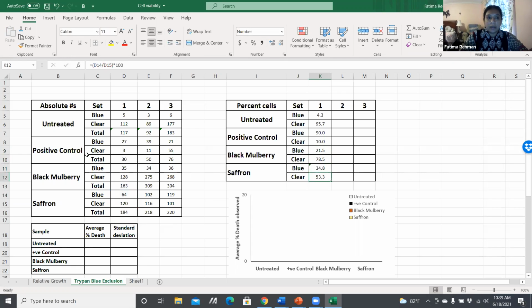This is one thing you can do. And so I just need to change this portion divided by the total right there. So once I have the formulas for that first column, I can drag it over, whether it's 3 or 100 or 1,000. I could just drag them all the way across and the formula will be copied over. So all your other numbers are calculated automatically.